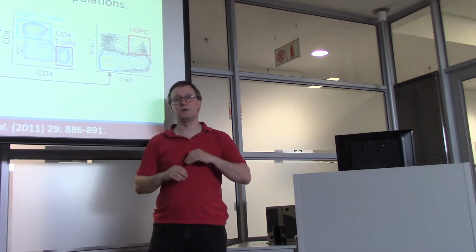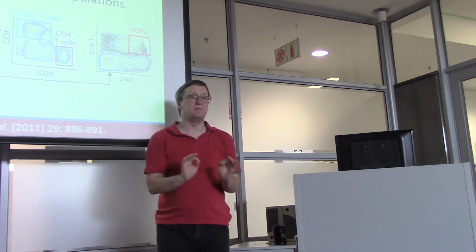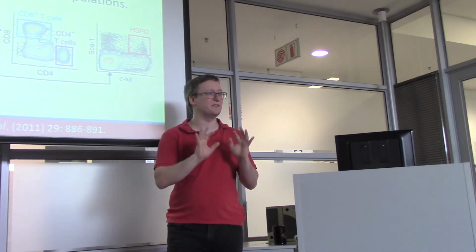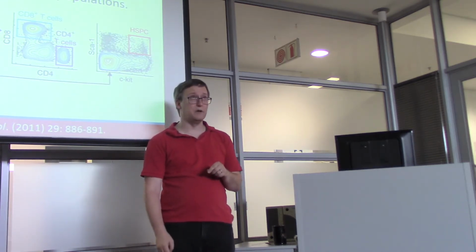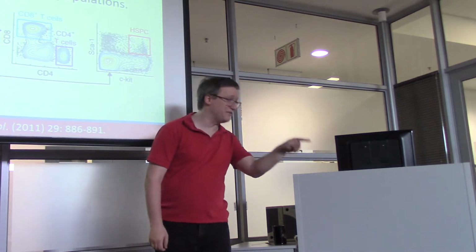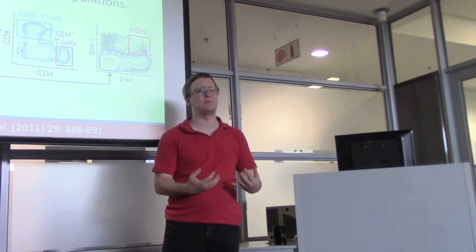So in this case, we're using multiple stages to figure out which particular cell population matters to us. I think it's become pretty clear already that the complexity that's possible when we measure lots of different markers for how we're going to do gating can be really frustrating if you're the person sitting at the computer saying, okay, for sample number 200, we want to apply this rule, and then we're going to apply this rule on top of this population separated out from the first step. Doing this again and again and again is a very time-consuming process.